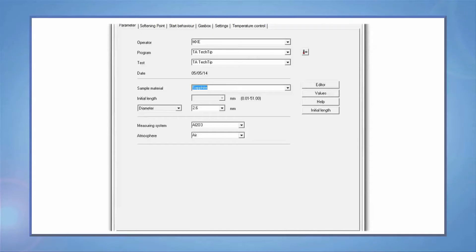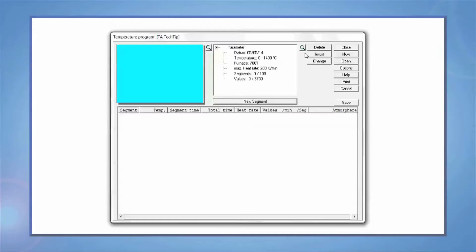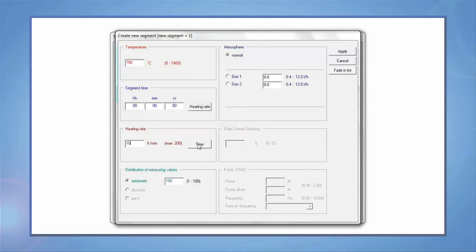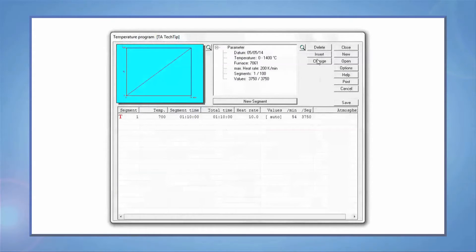Click the temperature program button to set up your experiment. Press the New Segment button and enter the maximum temperature you wish your experiment to go, as well as a heating rate. Select the Time button to calculate how much time the furnace will need to get the maximum temperature.